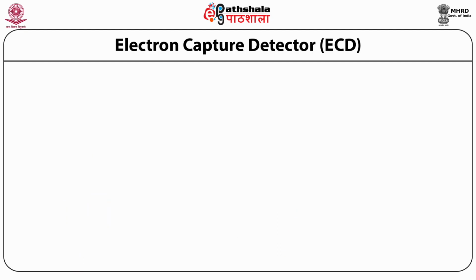The next detector we would be studying is the electron capture detector. It is non-destructive, concentration sensitive, and is the most sensitive non-hyphenated gas chromatography detector.